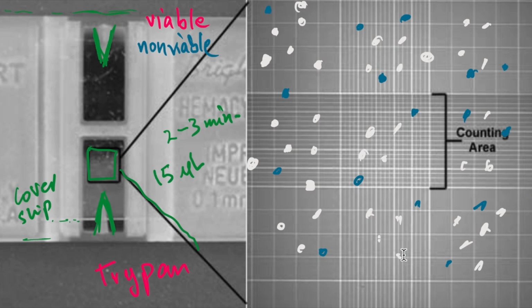The second rule: when counting the number of cells, we would count all the cells, but when we have to differentiate between them, we would refer to them as viable cells and non-viable cells. The second important rule that we will take into consideration is what happens when a cell is touching a particular boundary of a grid.